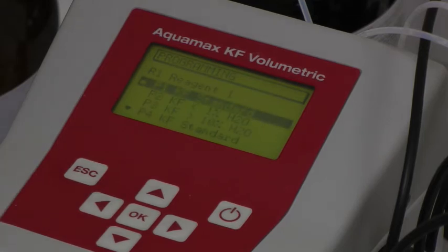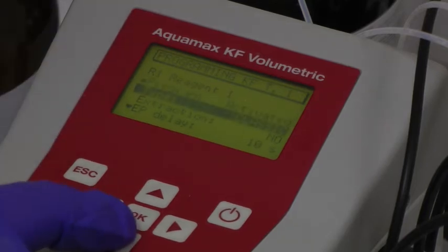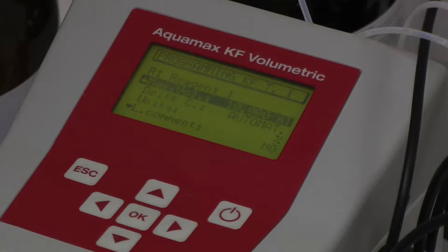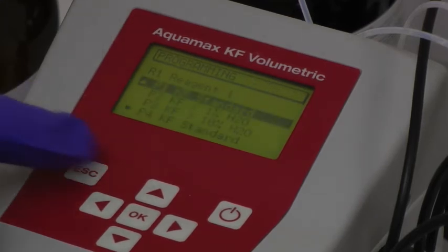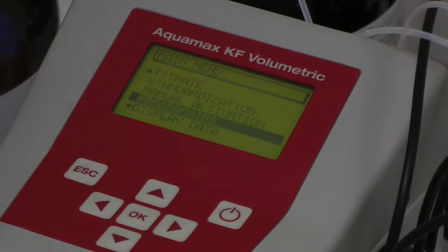The standard is chosen for the particular analysis. A sequence of parameters, clearly explained in the manual, is then entered for the desired standardisation and analytical method. Once this has been done, pressing ESC twice returns to the main menu.